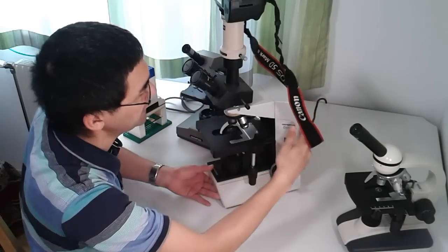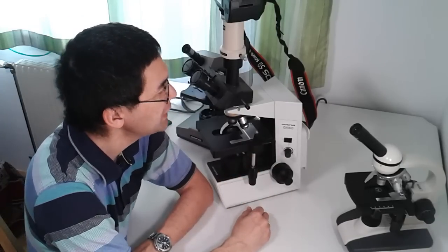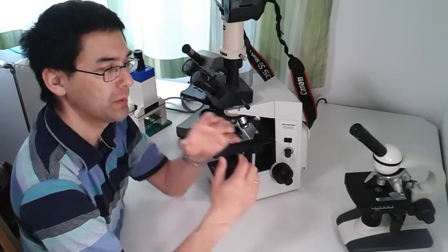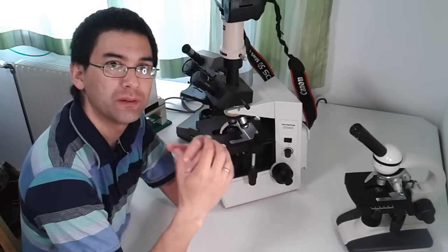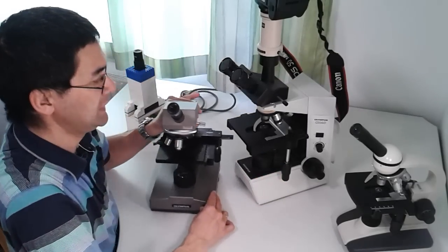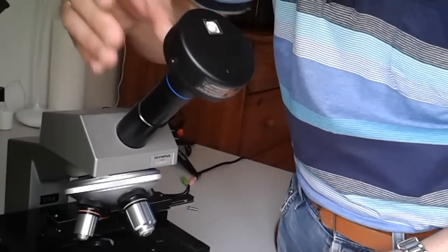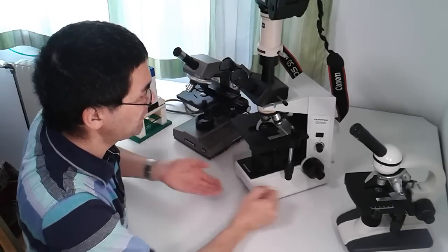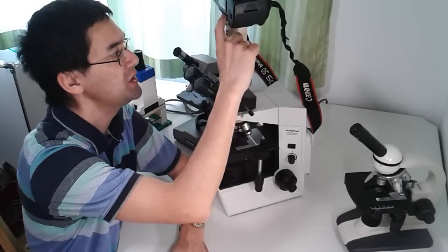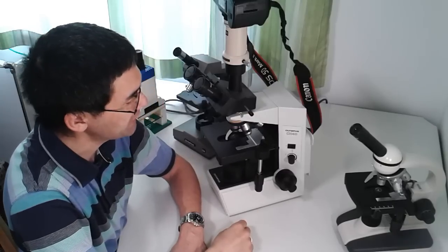As you can see, these microscopes have more similarities than you might expect. However, there are a few features on the CH40 that are really special and justify the higher cost. The most important for me is the photo tube. Twenty years ago when I got it, small low-cost USB cameras didn't exist. Nowadays you can just buy a USB camera, remove the eyepiece, insert the camera, connect it to a computer and take pictures. But back then, the only way was to use a film SLR camera, which is why this large adapter was so important.